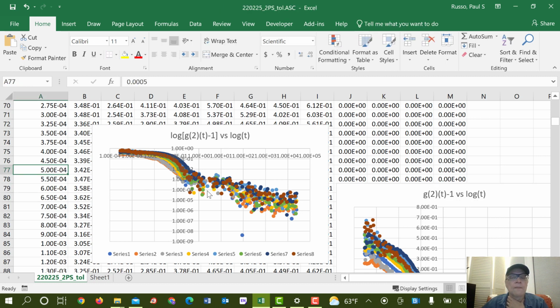And I guess that could be kind of useful. We could sort of look at what's going on here. There's this rapid decay and then some really slow decay here, which may be due to dust or fluctuations or something. But I would assert that most of what we want is sort of terminating around here. This is, can't read the axis too well, 10 to the -1, 10 to the -3, 10 to the -4. That's got to be about the limit there.